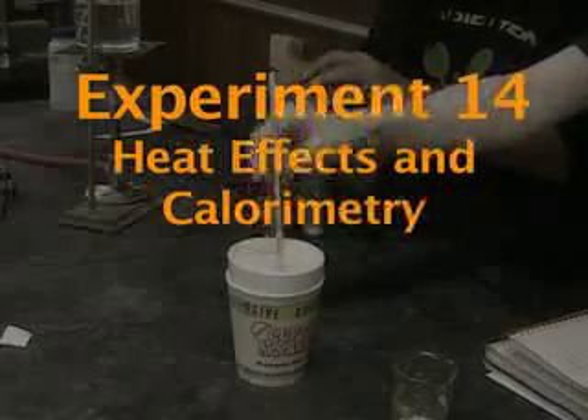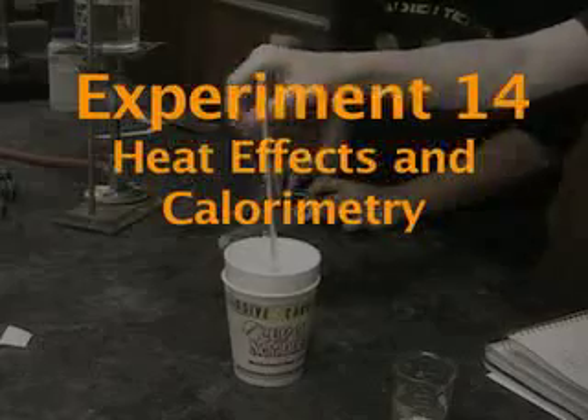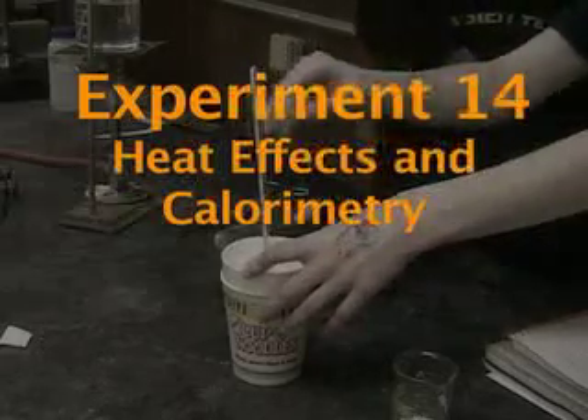In this experiment, we'll do calorimetry on three different types of things. We'll find the specific heat of a metal, we'll find the heat of solution as something dissolves, and we'll find the heat of neutralization as some acid and base neutralize.